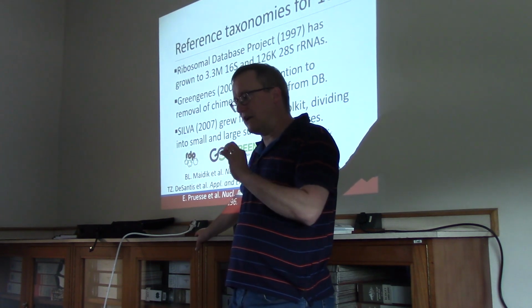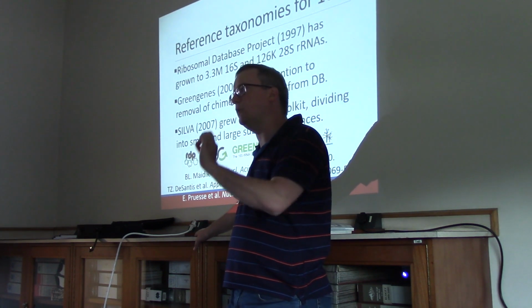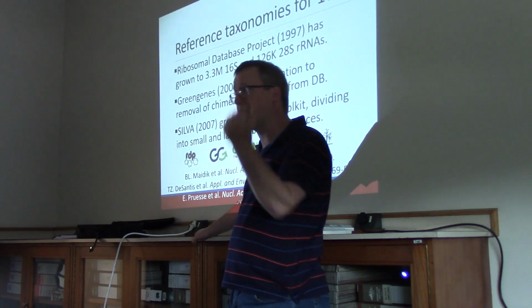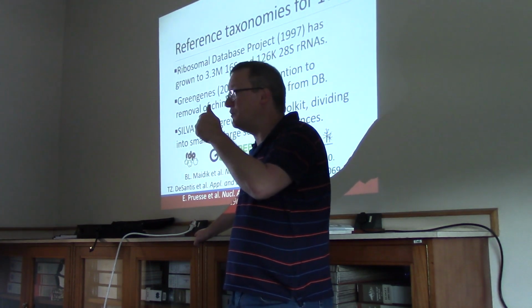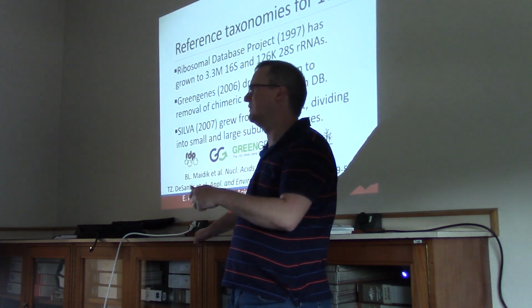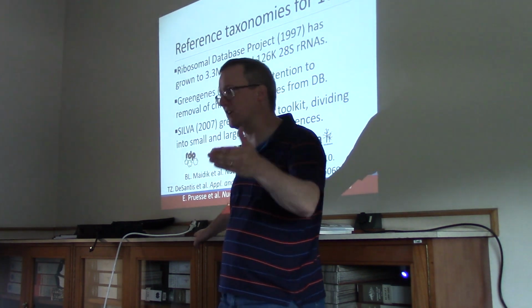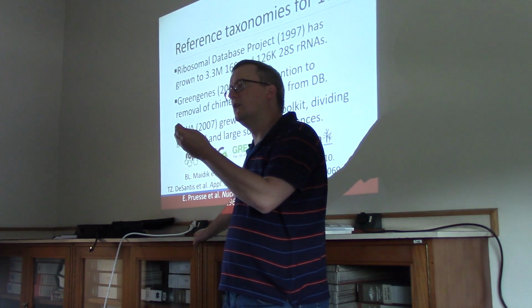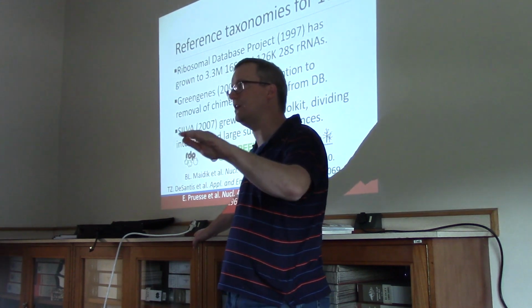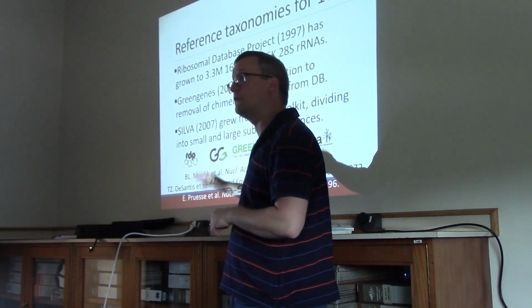So I would ask you to think of this identification process as being one in which we are going to get a consensus sequence to represent each OTU. That's what the prior slide was all about. But when we want to translate that into taxonomic information, to actually say, oh, this is Escherichia something, this is Bacillus something, this requires that we're able to translate these consensus sequences for a variable region into a taxonomic identity. It's almost always done through lookup.